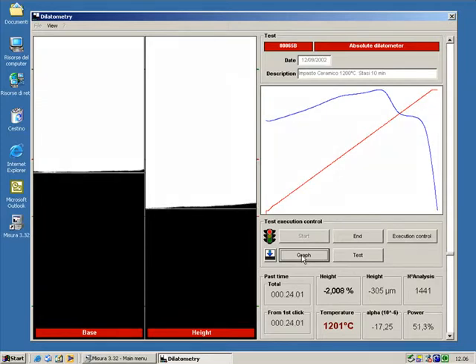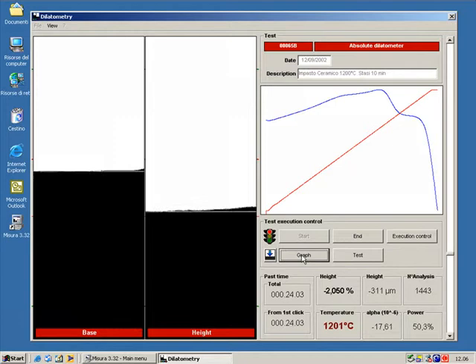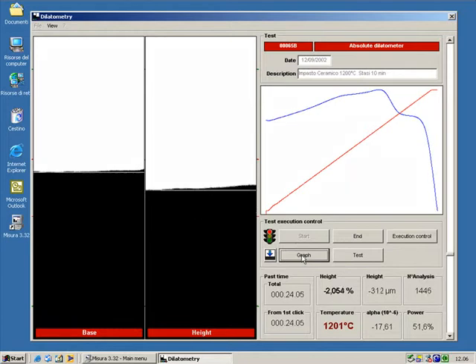The material is sintering very fast and the step motor is working quite often to bring back the image in the center of the window.